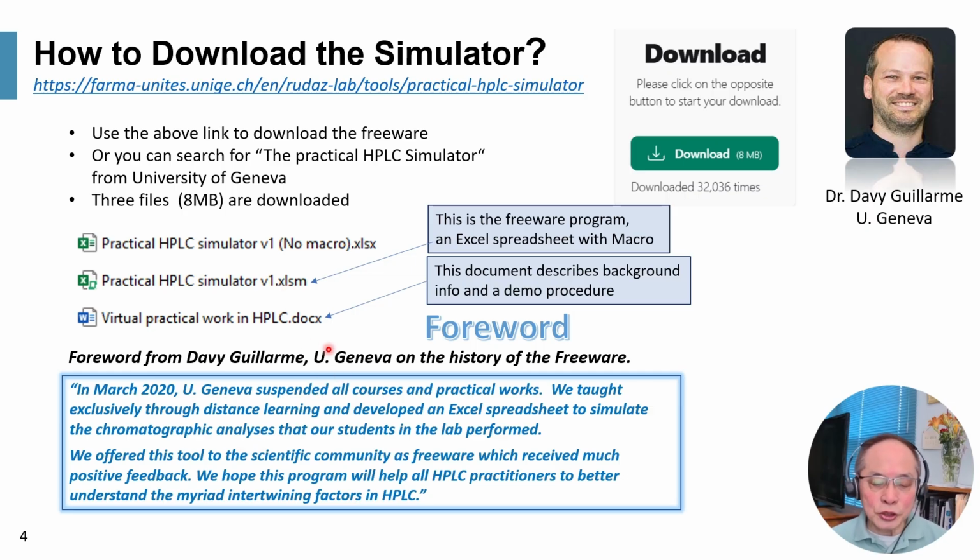There's also an associated manual, which describes the theoretical background of the software, some terminology, and also gives you a very simple demo process, I think using a case study on separation of parabens. The one that I'm doing will be something different. It's going to be a gradient-based and more pharmaceutical analytical example.